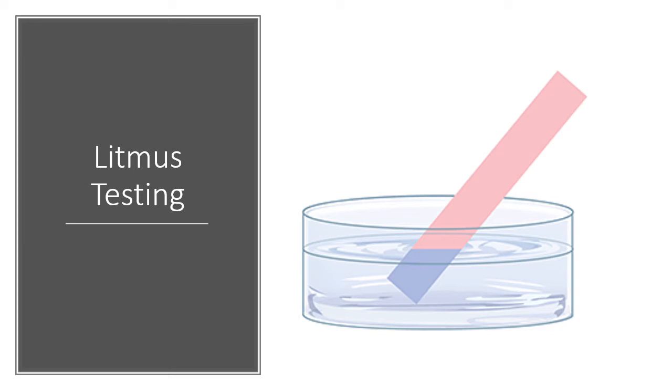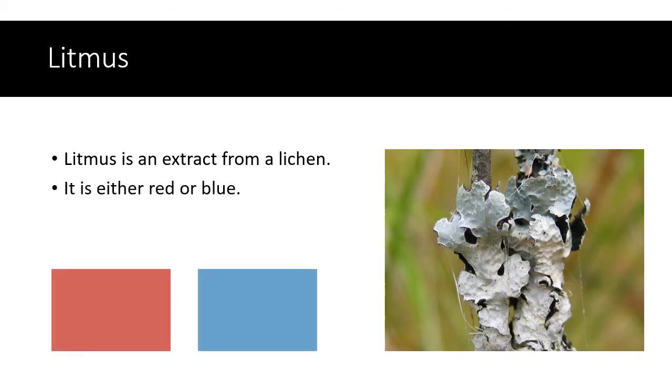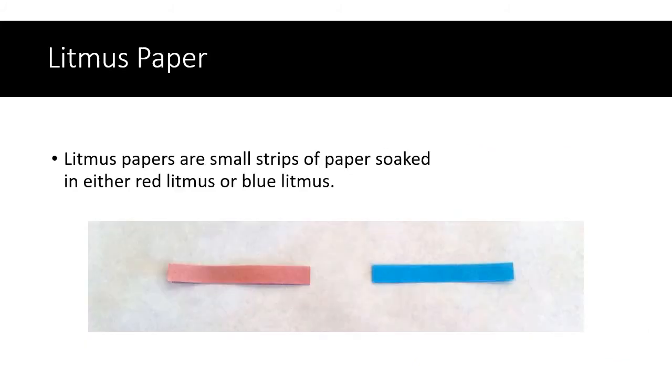In this video we're going to do some litmus testing. Litmus is an extract from a lichen — those crusty little plant-like substances you'll sometimes see growing on the sides of trees or on rocks. Litmus can be either red or blue in color. The way we normally use litmus is to soak small strips of paper in the red or blue litmus, then dip those bits of paper into different substances to test them. Let's see what happens when we do that.